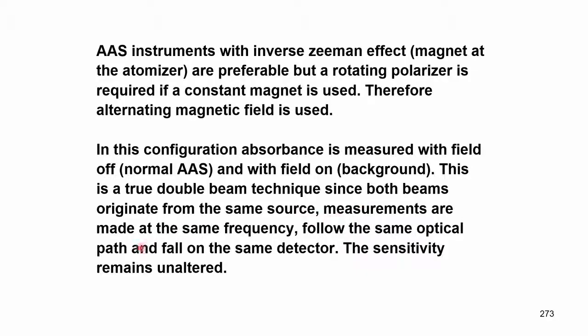So, the measurements are made at the same frequency. They follow the same optical path and fall on the same detector. So, the sensitivity remains unaltered.